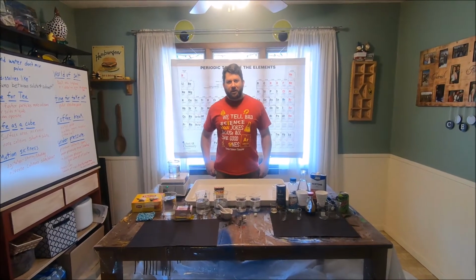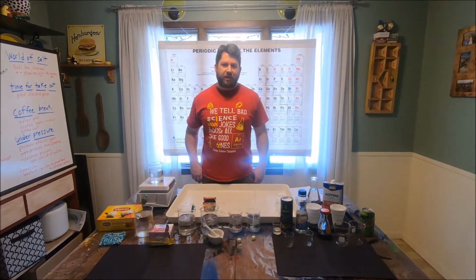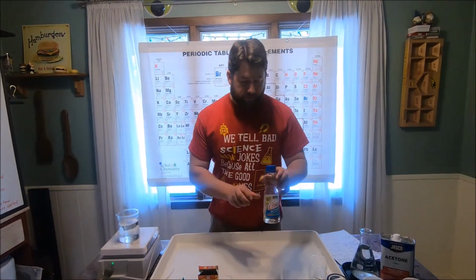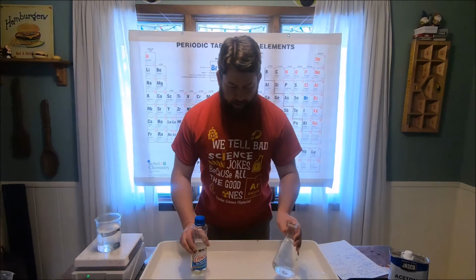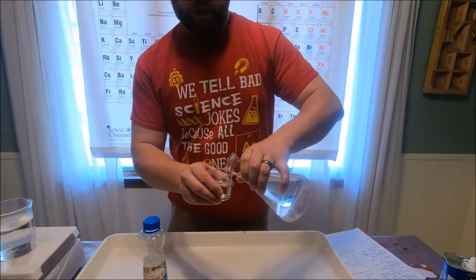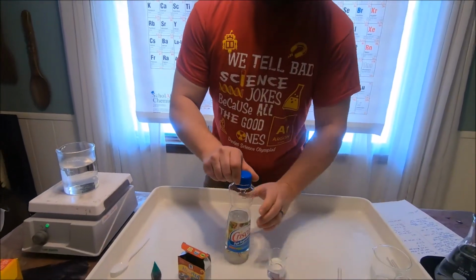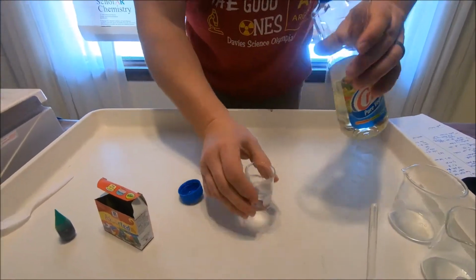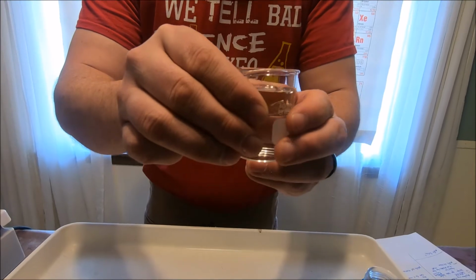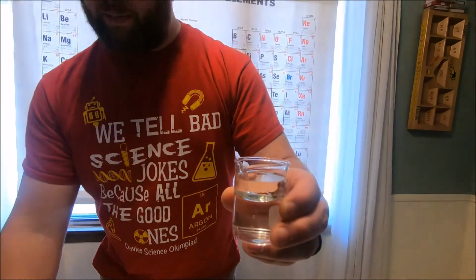Well, greetings, chemistry department. We're going to look into factors affecting solubility and the rates of dissolving different objects and things today. So we're going to start with just the idea of oil and water, and the idea that water is a polar substance, we've talked about before, H2O, and oil, a nonpolar substance. And so when we mix the two together, we can see that the oil layer is on top and the water is on bottom, and that they don't want to mix together.